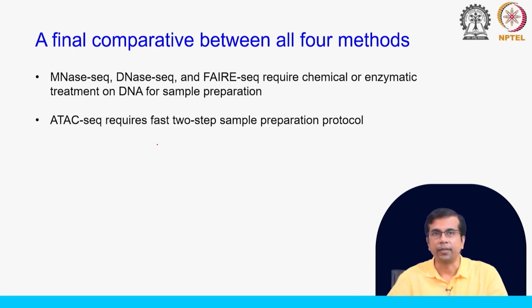In comparison, ATAC-seq requires a very fast 2-step sample preparation protocol. It utilizes this Tn5 transposase, which actually integrates these adapter sequences, these are from NGS adapters, directly into the genome and prepares them for library preparation and sequencing.